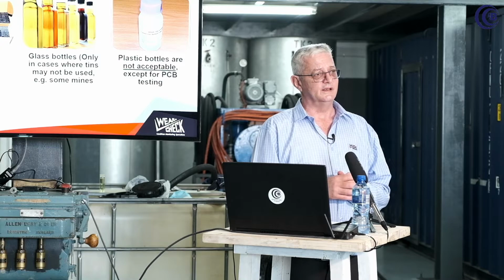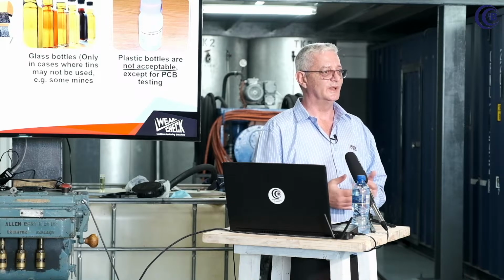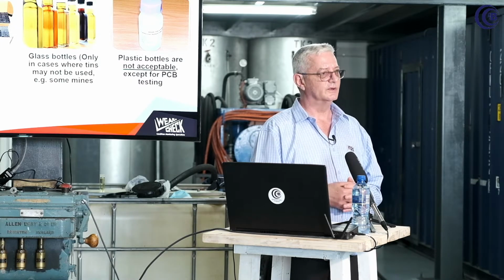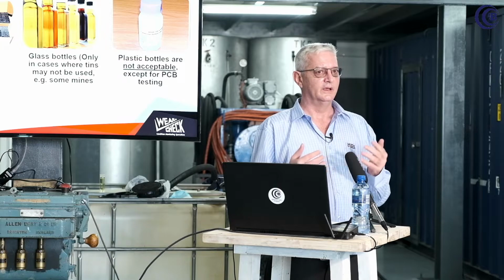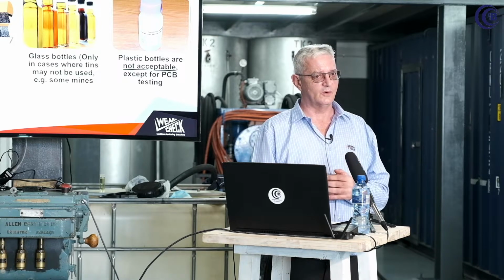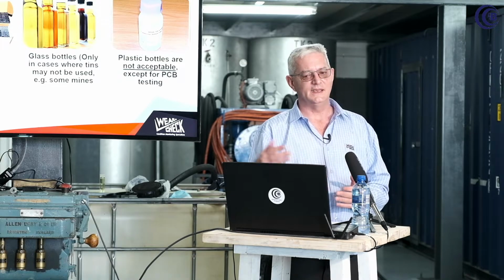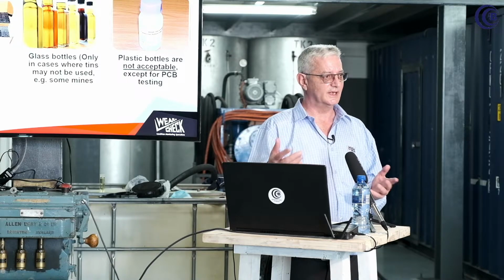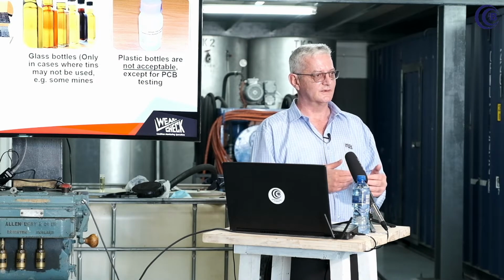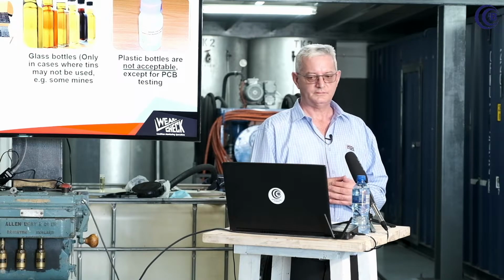The disadvantage of a syringe is that it only holds 30 or 50 mils. We can't do all the tests; we can only do a DGA. So this is a sampling container, especially for the newer energy sources like your wind farms and your solar farms, where they mainly only look at your gases. Once a year they will test the full range of tests, for which they take a tin. But during the year, when they monitor a transformer for accuracy, they take syringes.